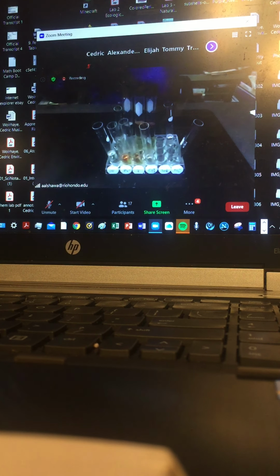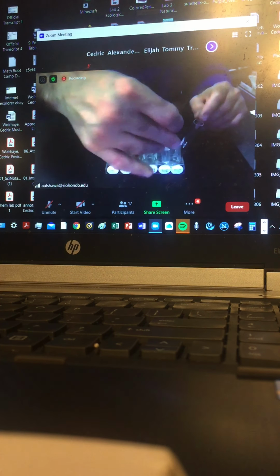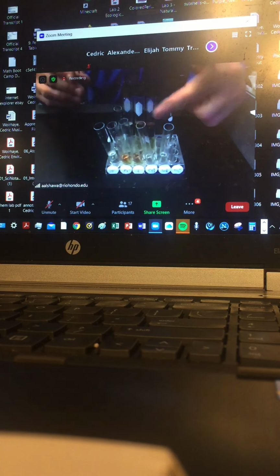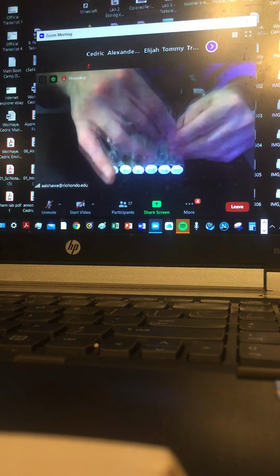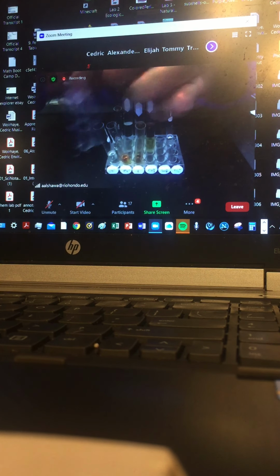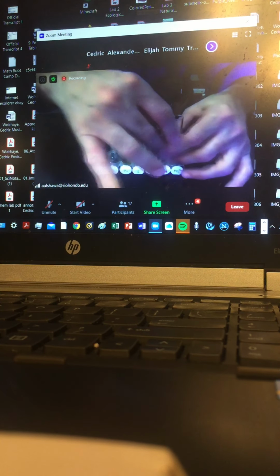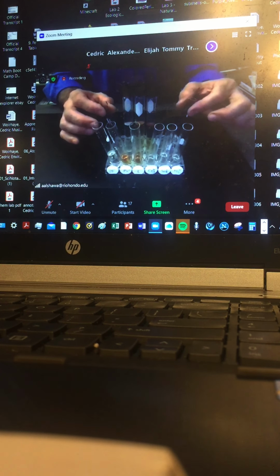That sulfate polyatomic ion, I want to add the hexane layer and mix them, and the outcome remains clear. So I would anticipate negative for the case of polyatomic ion. Okay, so for the polyatomic ions, carbonate, sulfate, and phosphate, the outcome is clear, as obvious. Now I want to do the same for unknown 1 and for unknown 2.